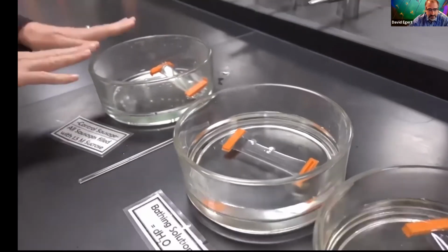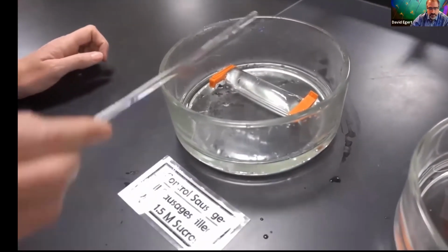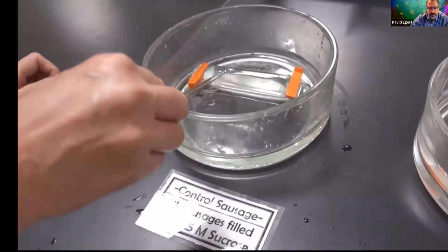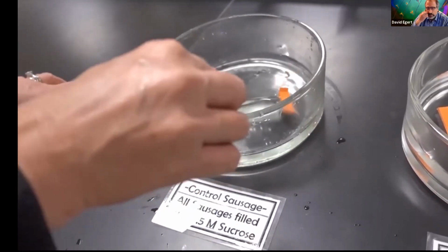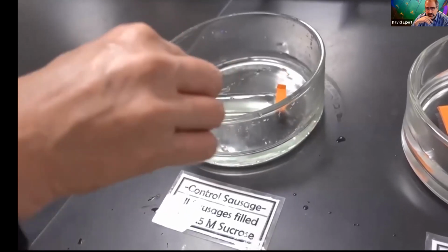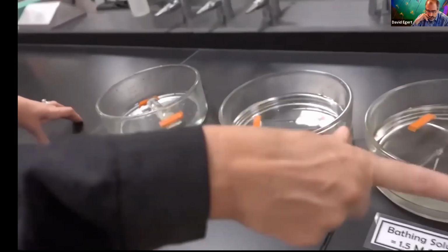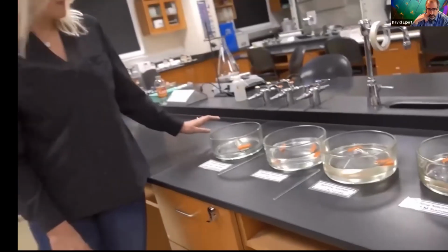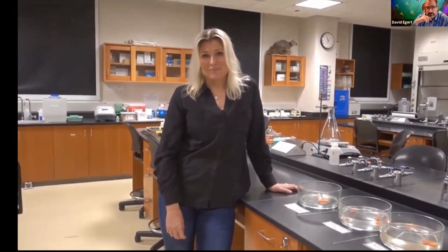I'm also going to leave this control sausage here because when I come back in 30 minutes, I can tap on this and feel what the original consistency of the sausage was, and then compare what has happened to the other 3 sausages. So we'll come back in 30 minutes and take a look at them.